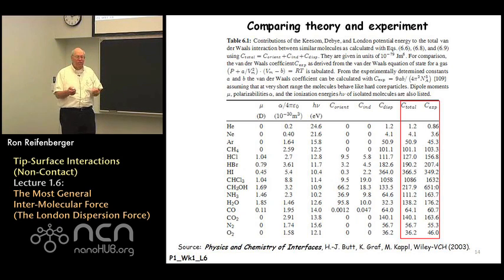So you can get a sense of how much each interaction potential energy contributes for maybe a dozen or so different molecules. So you can look at this table and see how close experiment and theory are in many cases.